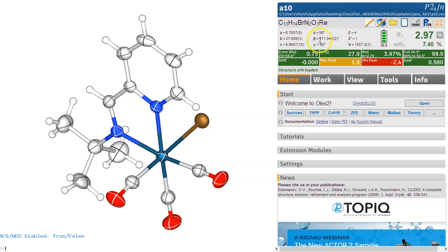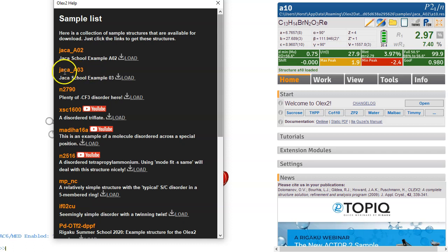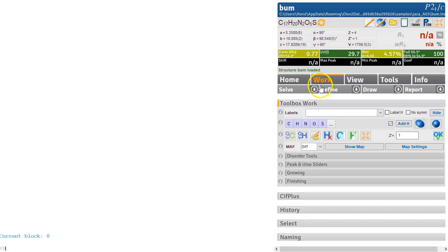We just finished with the first of the Haka samples. Let's go to the second. Start, the three dots, and it's that second one here, Haka AO3. Loading this by clicking on there. The structure again isn't solved, so the first thing we need to do is solve it.